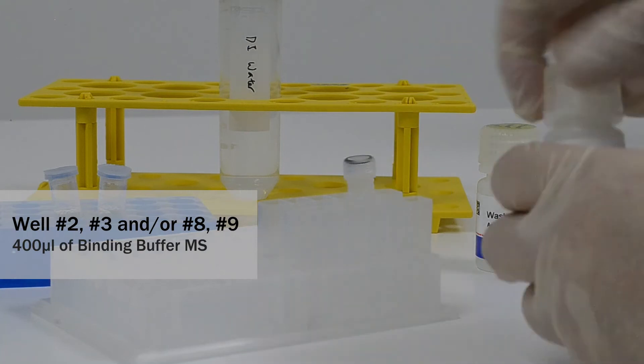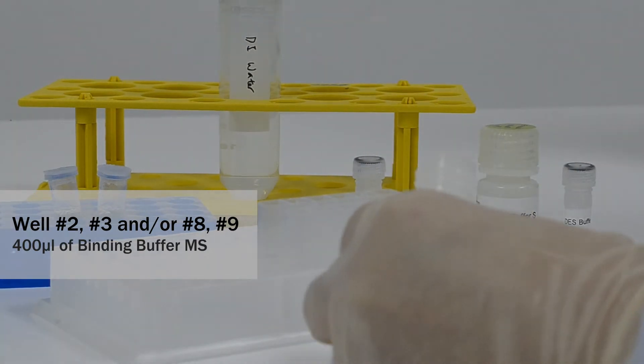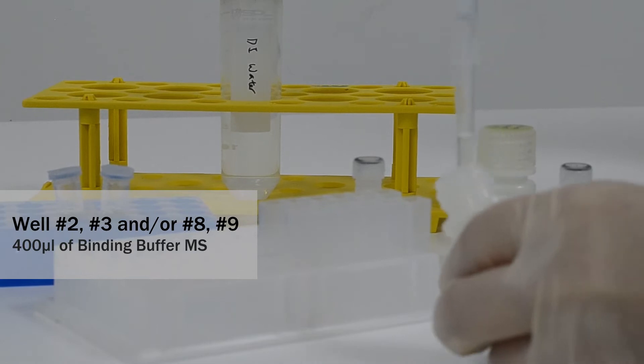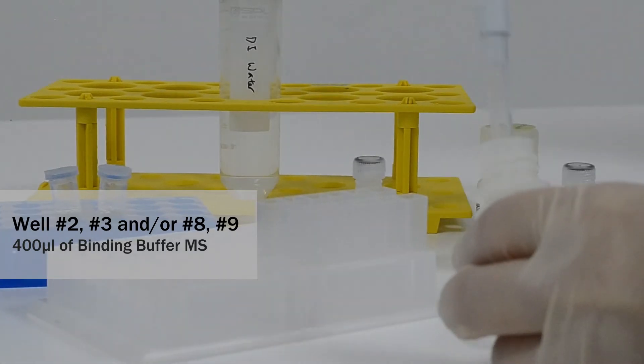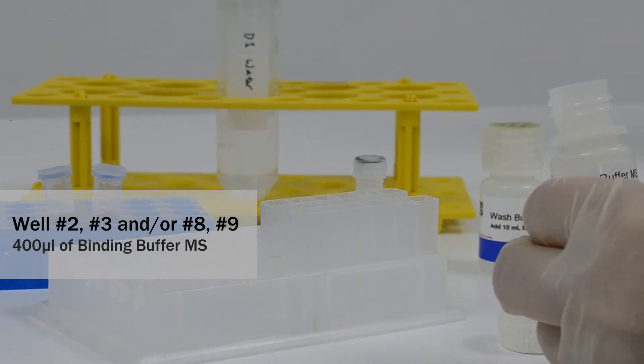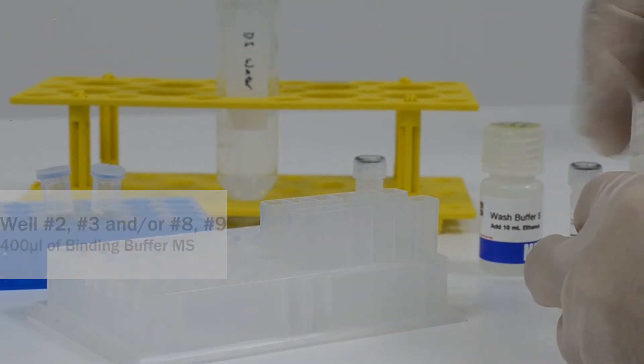Next, add 400 microliters of binding buffer into the second and third wells. If you are using 96 deep well plates, you can allocate it into the second, third, eighth and ninth well or column.